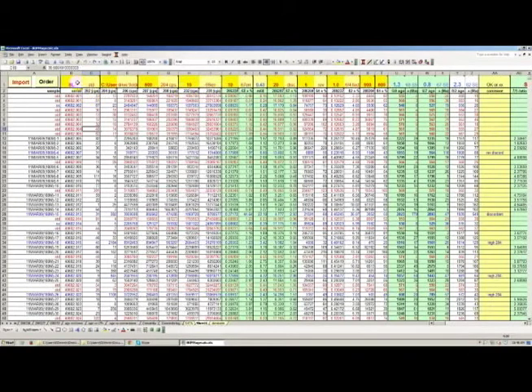We've already used cells B1 and C1 that are just telling the program, the reduction macro, what the standard is that you're using. We've already used D1, that is just the cell that contains the folder path where the reduction is going to be directed. And now we're going to look at all these others.